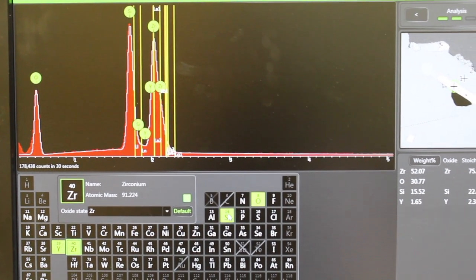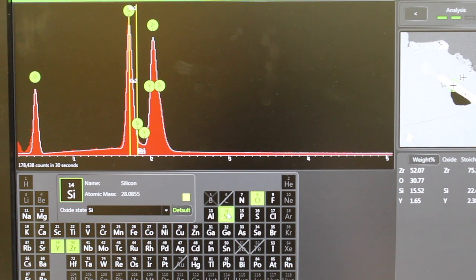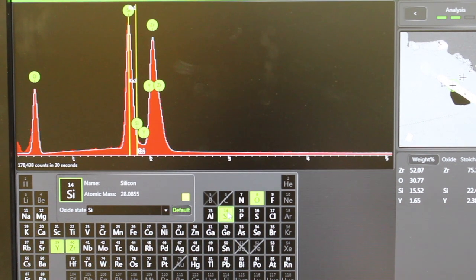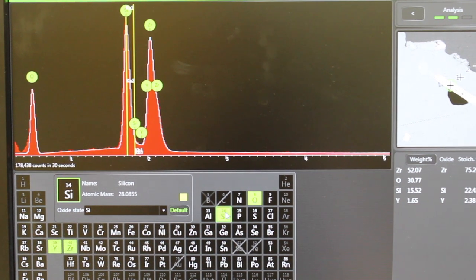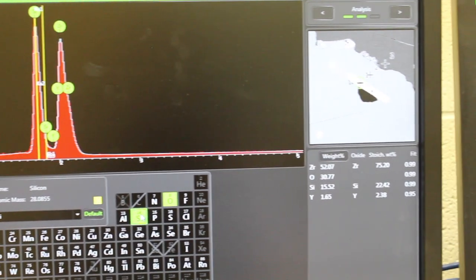We have silicon. Okay, and we may be thinking at this point, wow look at this mineral.